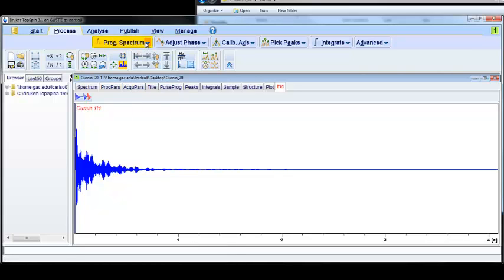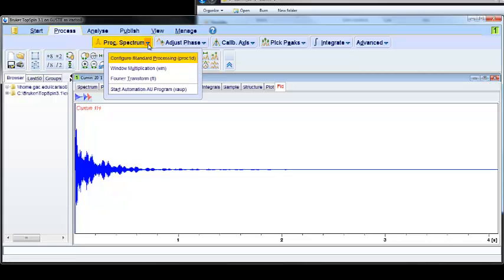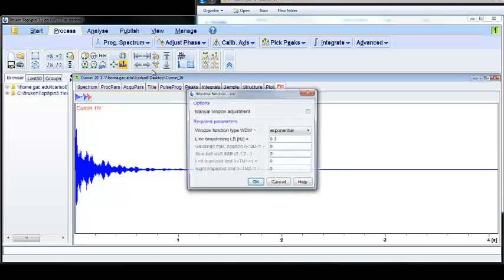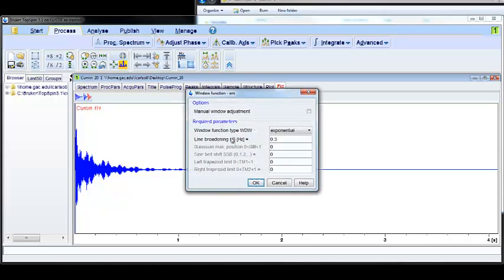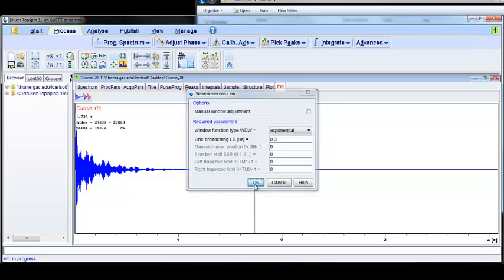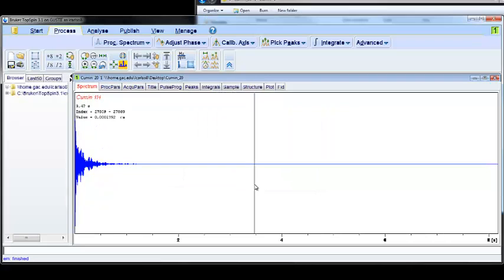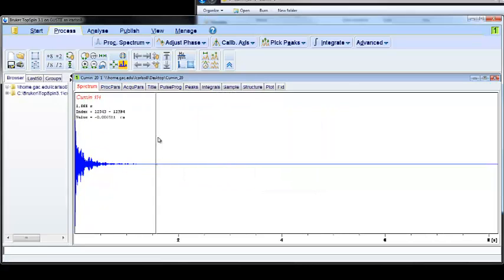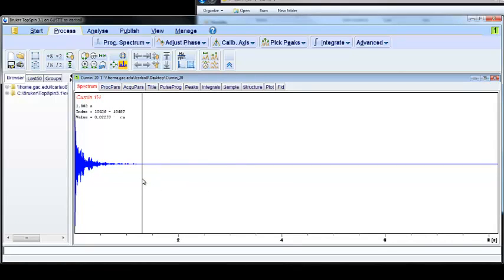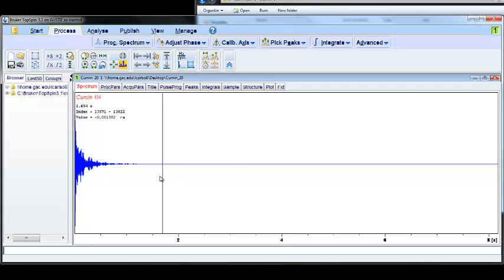If I click on this down arrow under Process Spectrum and click Window Multiplication, this is already set up to do exponential multiplication. I'll just click OK, and you can see that a lot of these points that were out here are now gone. It's important to know that although this process improves the signal-to-noise ratio, it also decreases the resolution of your spectrum a little bit. It's important to know that tradeoff.